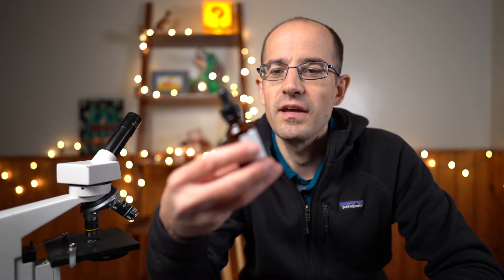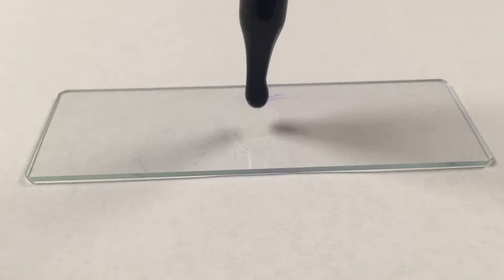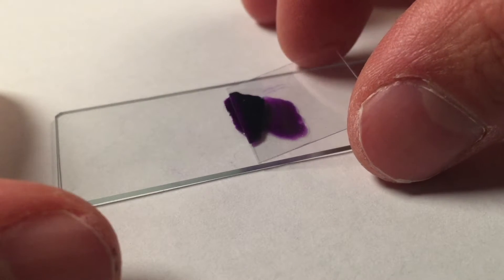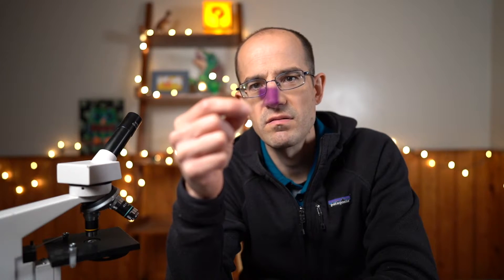Now we need to put a stain on it. A lot of people will use blue food coloring, some will use methylene blue — methylene blue is probably the most common — but what I found works the absolute best is dilute crystal violet. I have labeled it 'cheek cell stain.' It is sold readily at science supply stores, and hands down it is the best type of cheek stain. We are going to put a drop of it on our slide, dropping it down at an angle to decrease the number of air bubbles. In the end I get a slide with just a couple of air bubbles — not too bad.